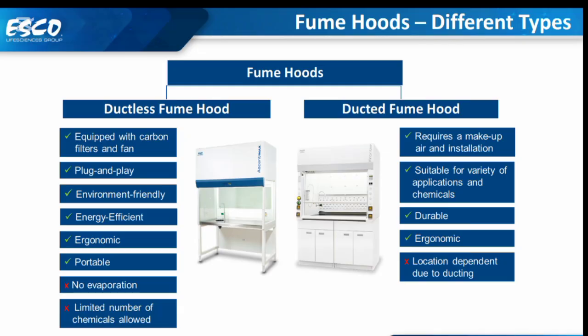Does anyone know the importance of no evaporation in the ductless fume hood? I think we have gone through that.